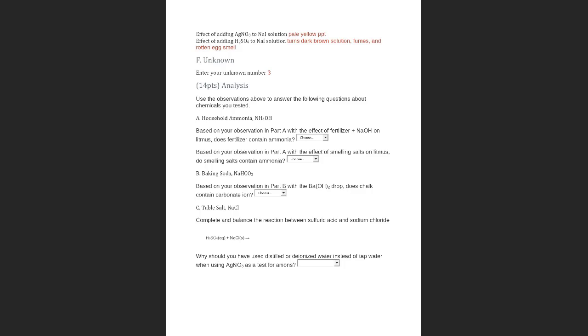It's given to you. And then they will ask you, why should you have used distilled or deionized water instead of tap water? That is obvious. And you will have that also in the videos that you are going to watch. What happens if you are testing chlorides and you use a source of water that already has chloride, right?